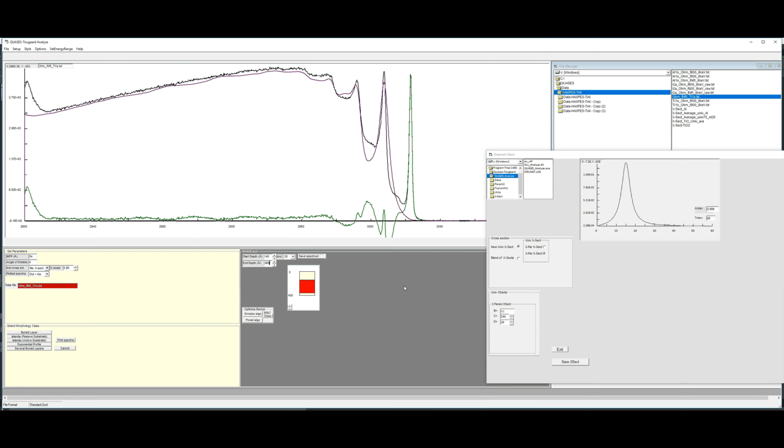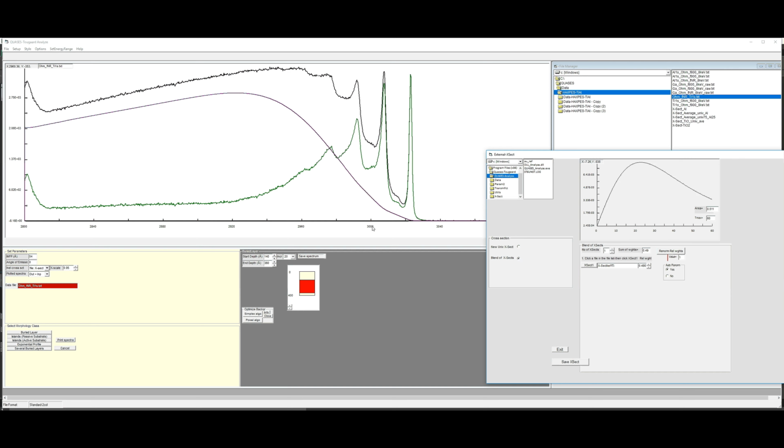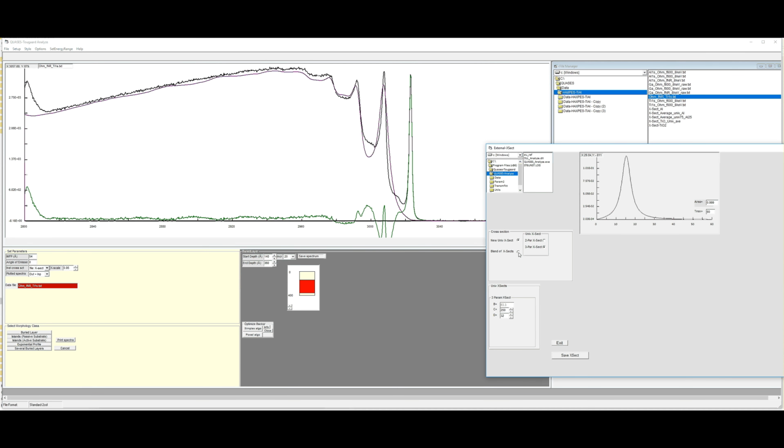We could, instead of using the 3-parameter cross section here, also use a blend of cross sections. So we could take a cross section valid for titanium and one for aluminum and make an average of these. This is what you can do with this facility in the software here, the blend of X sections here. Let me illustrate that here.